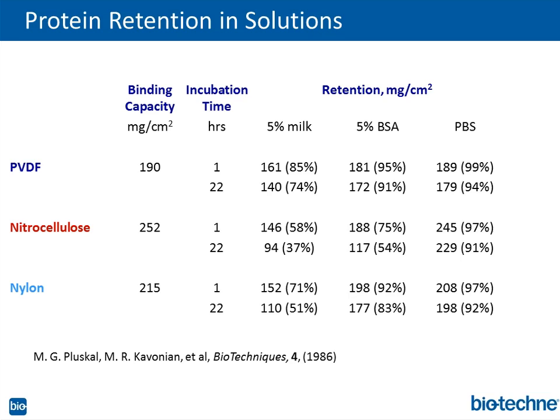Because remember, you have to get into a polar state to get those blocking agents to penetrate the membrane, and those aqueous antibody solutions to penetrate that membrane and get to your protein. So again, the drying trick is just a way to potentially minimize protein loss, and that's it.